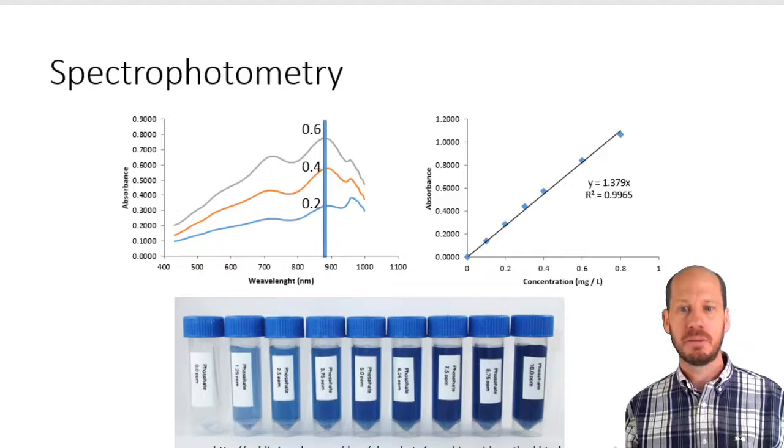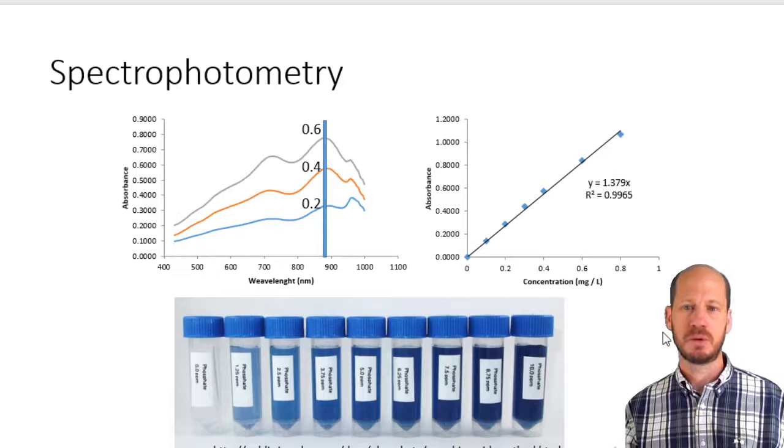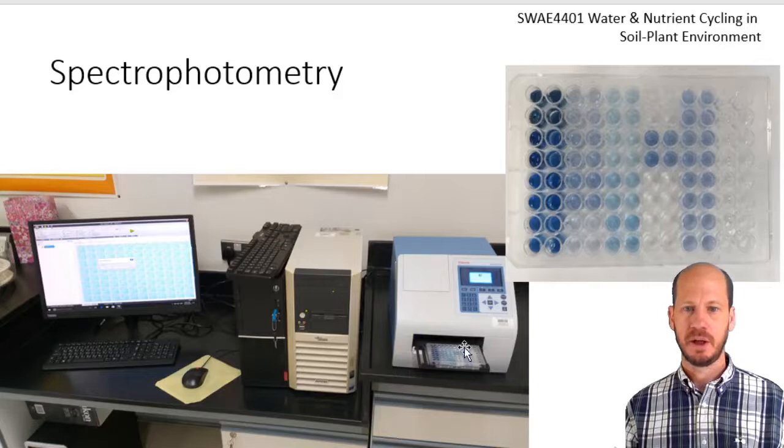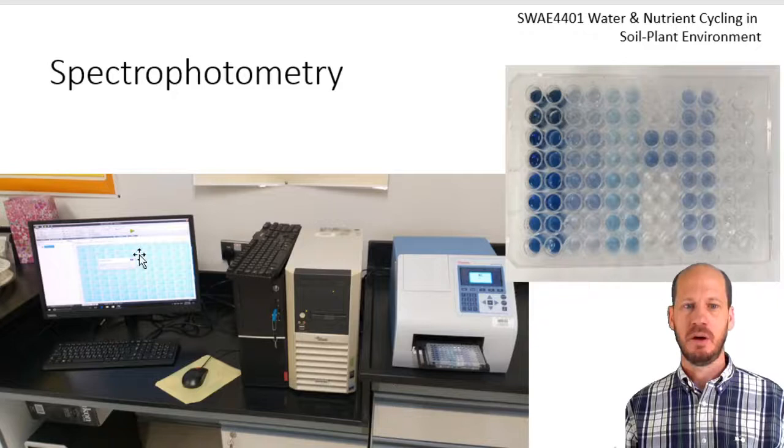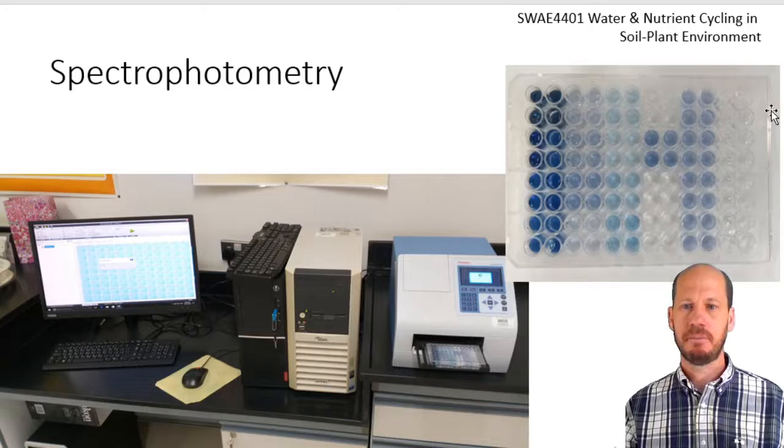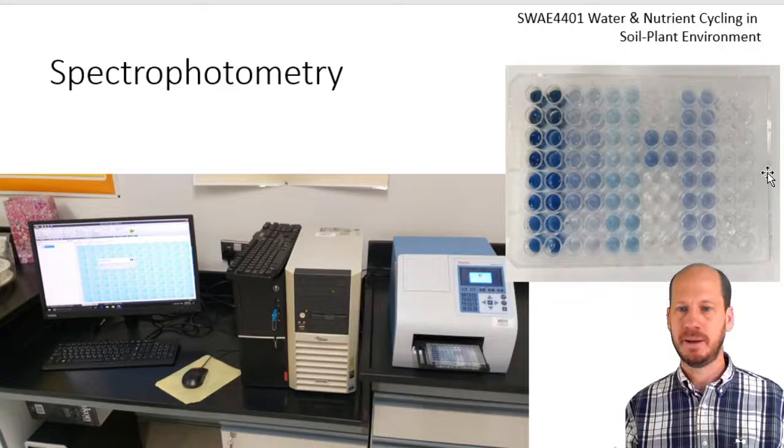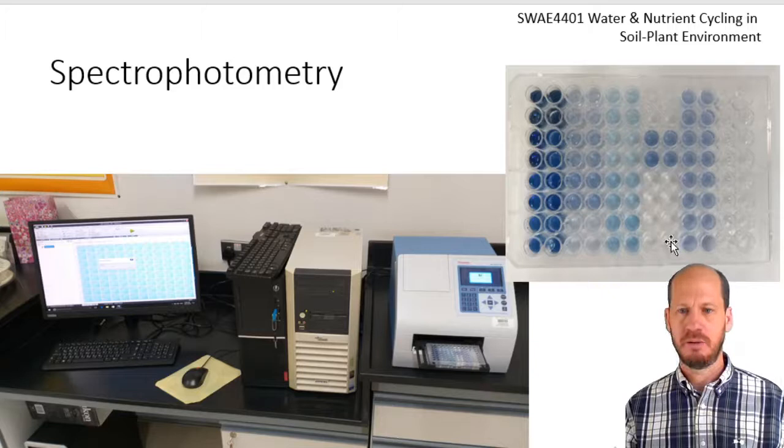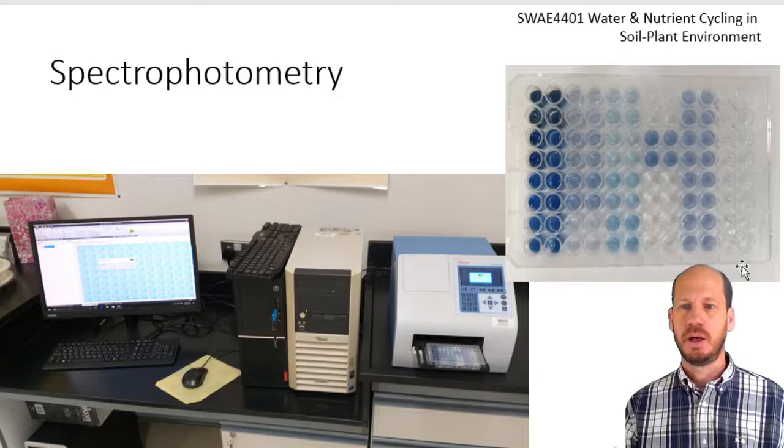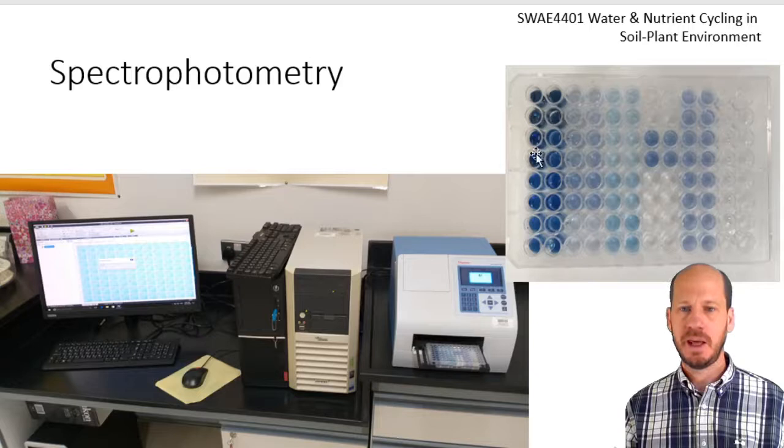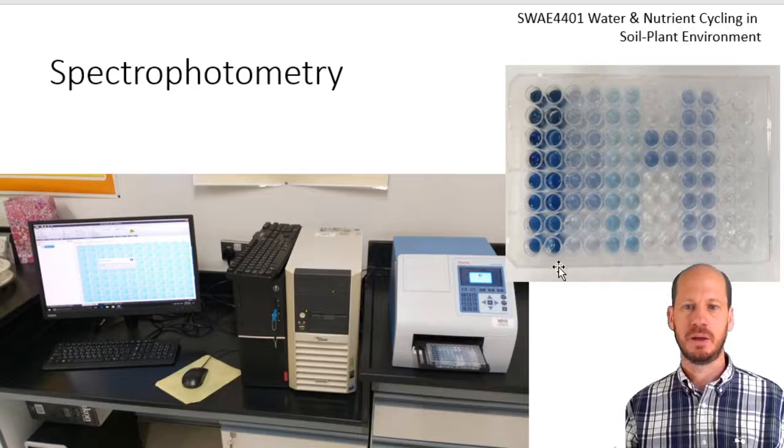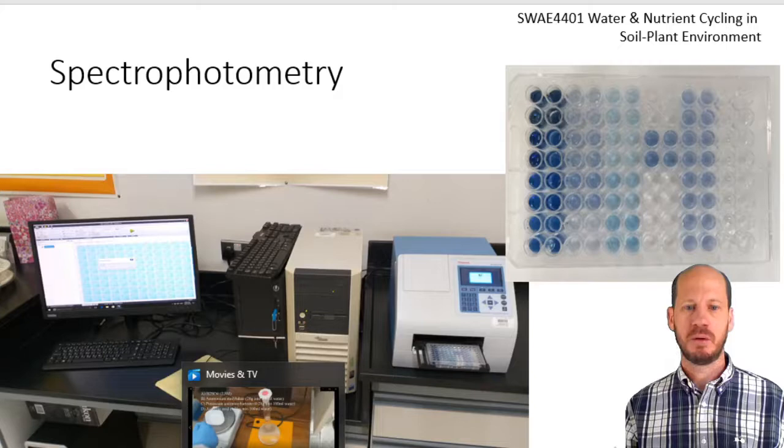Let me show you the equipment. We have on the right the plate reader, on the left the computer that controls the plate reader, and here is the microplate. The microplate is just a transparent plastic tool that has very little absorbance of light. We can place 300 microliters maximum in each well. It has 96 wells in total: 8 rows and 12 columns.